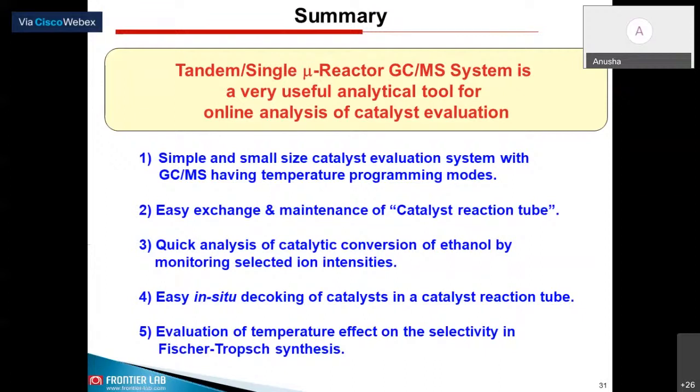So you can specifically select, as I have already mentioned in my slides, that m/z is nothing but the ion intensity. So you can just put your selected ion intensity into the software. We also have the software, and even during the data evaluation part, you can quickly monitor your selected ion intensities.